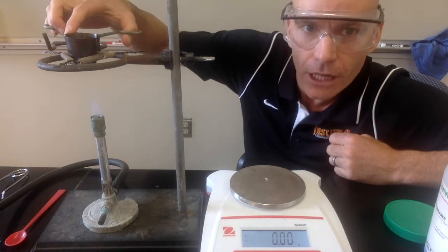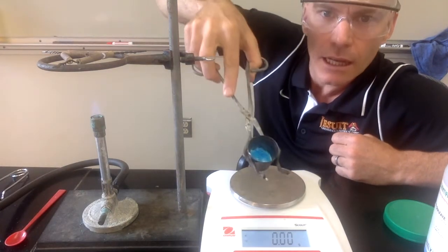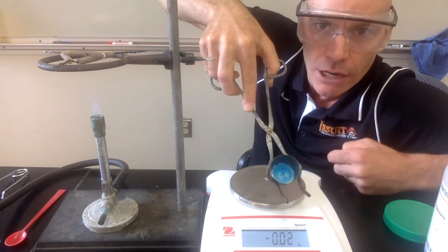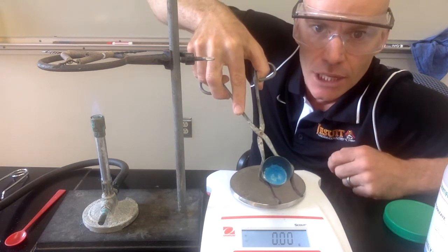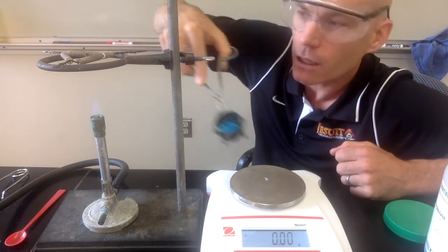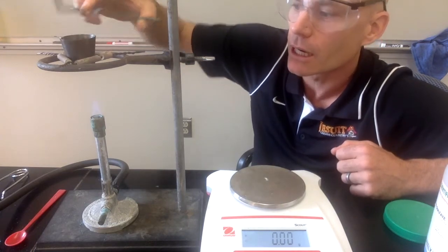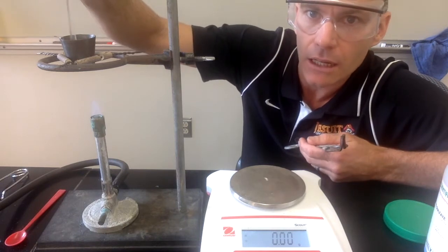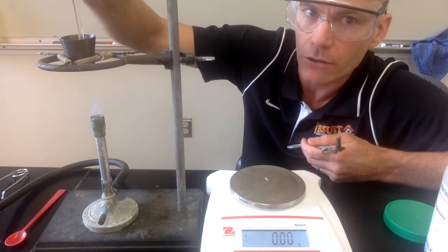We've been heating this for a couple of minutes now. Some of that bright blue color has gone away — you can see it's kind of whitish-gray around the outside. We're going to continue heating it until it's all that whitish-gray color. I'll put it back on the Bunsen burner, occasionally stir it, and continue heating until all the bright blue color has gone away.